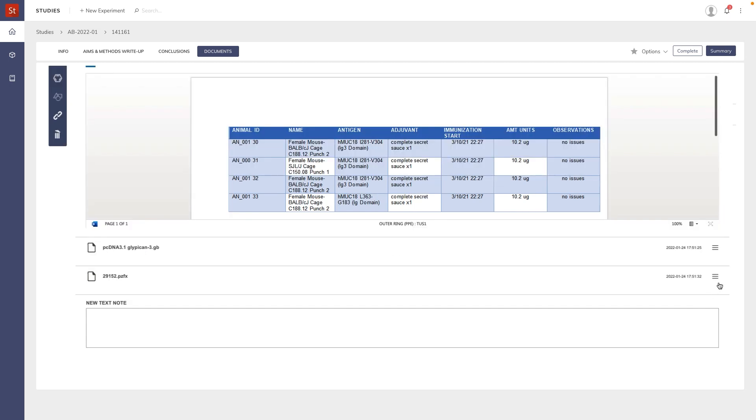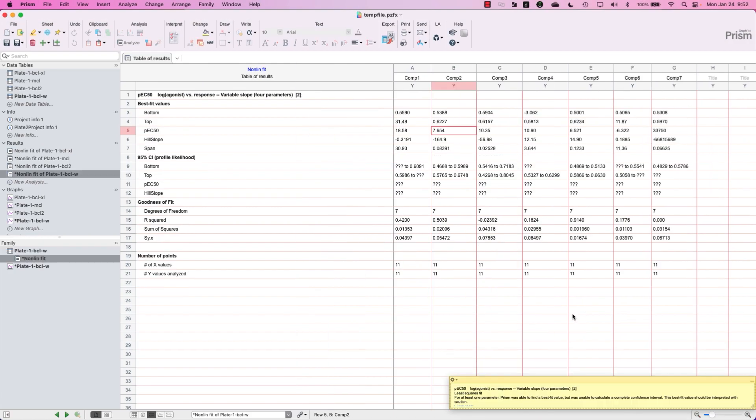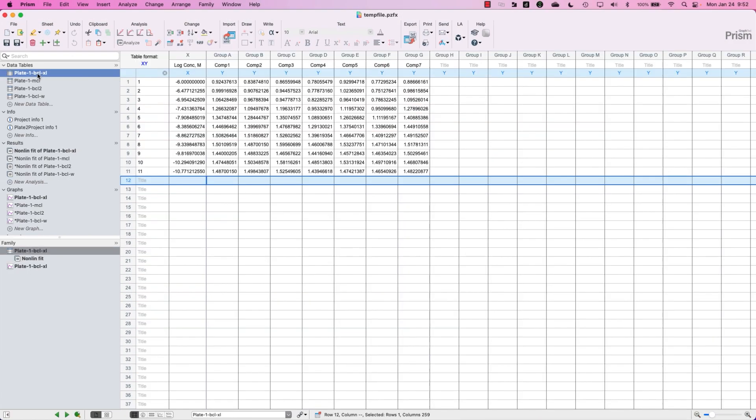Similarly, while we don't currently see a preview of the Prism file, which is a work in progress, we can still open, edit, and capture changes here as well. In this case I want to correct a mistake with one of my starting concentrations.